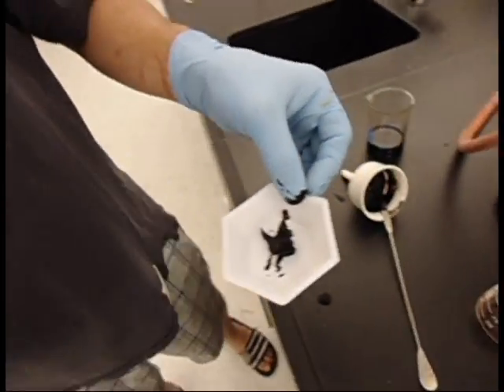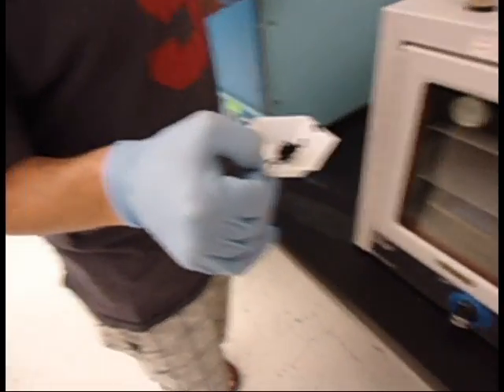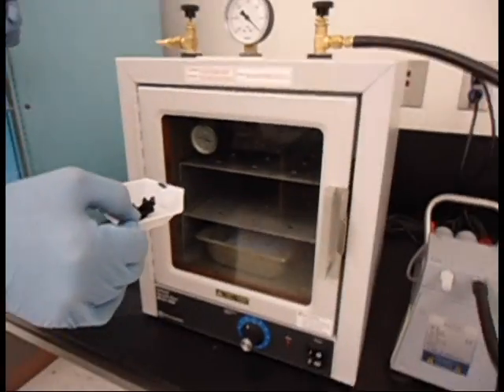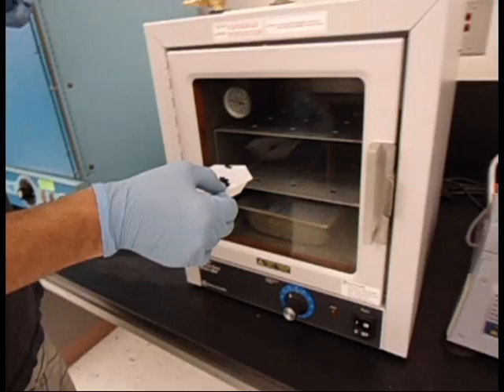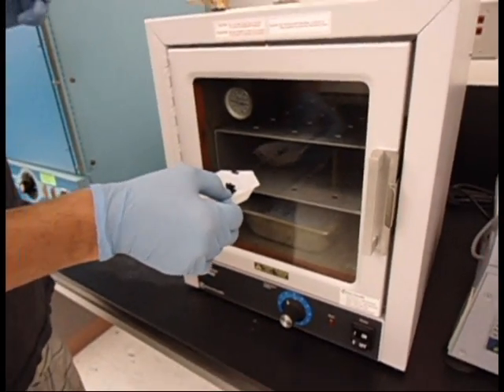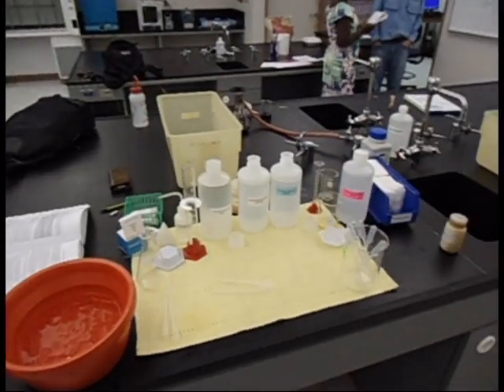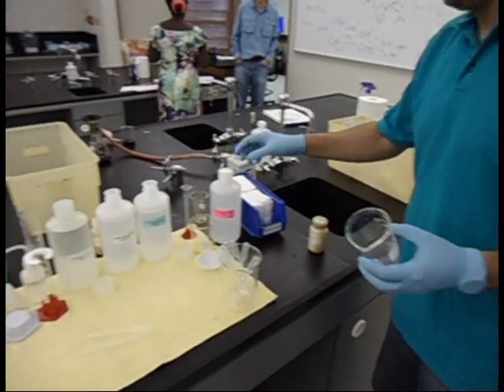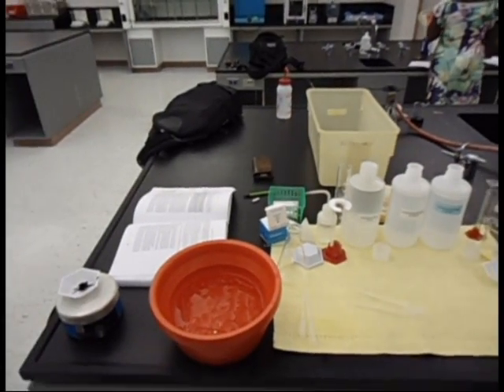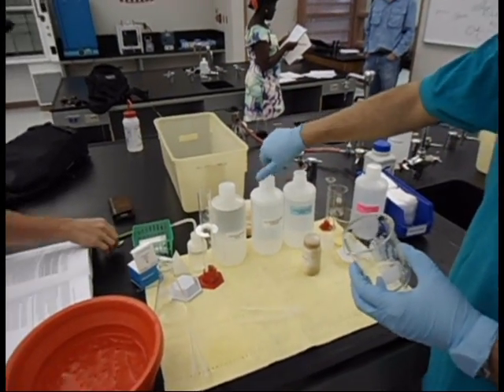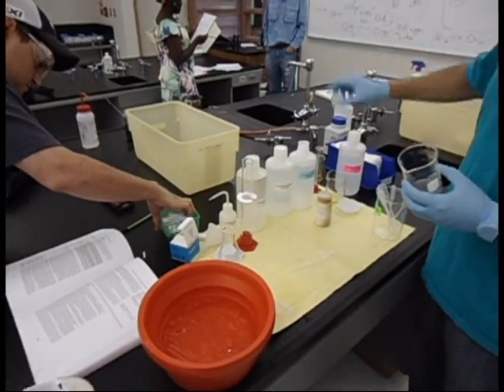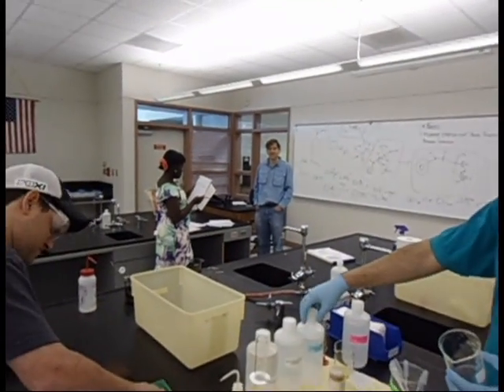We're going with the dye and putting it in this drying oven overnight. That'll give us the finished, nice dry dye. Obviously this lab created a bit of a mess, so don't forget to clean up your lab station, because otherwise somebody else is going to have to do that, and they do not enjoy that.